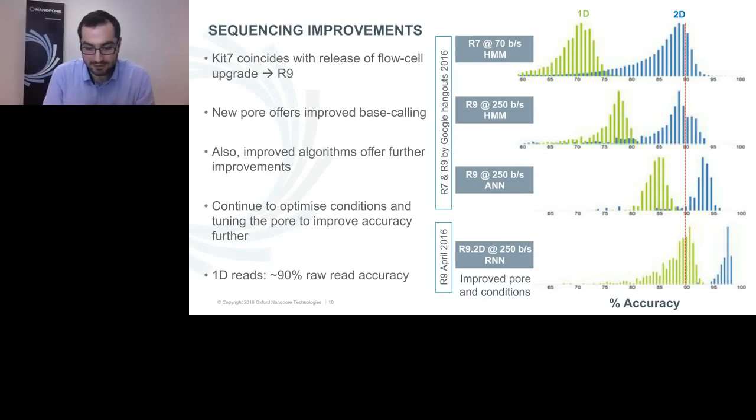We're not entirely sure of the exact mechanism for this, and I don't have a slide on it, but if you take genomic DNA and treat it with an enzyme which will randomly generate gaps in your DNA, and you run it against a library that has not been treated in that way, you see a high degree of blocking and a much reduced throughput from the library that has been treated.